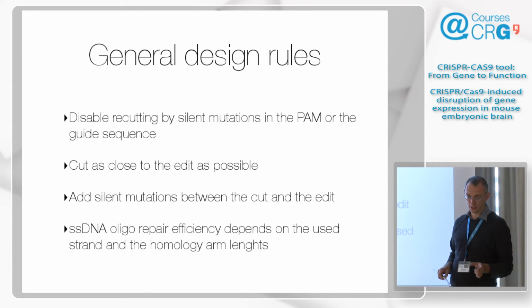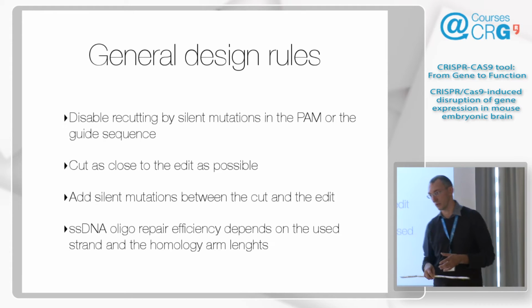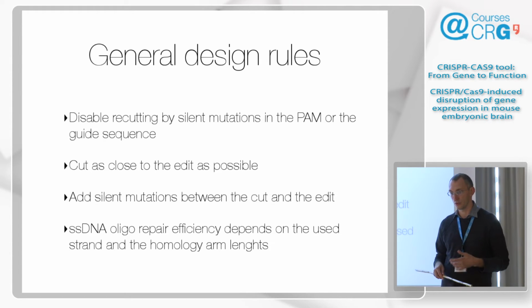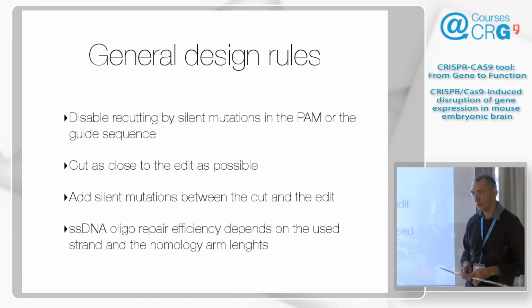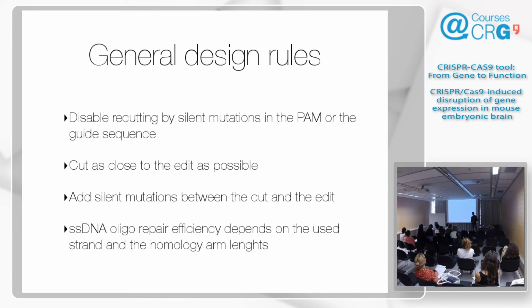When you're editing inside of a coding sequence, this is relatively trivial. You just use a different codon for the same amino acid, silent mutations, things are fine. We have had cases where we couldn't do that because the edit was of a transcription factor binding site and only one change was allowed. And we were able to get this from first try. So it is not impossible. This is not a must, but if I can do it, I always do it.